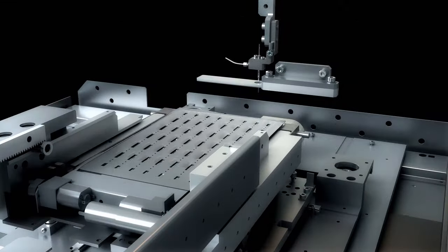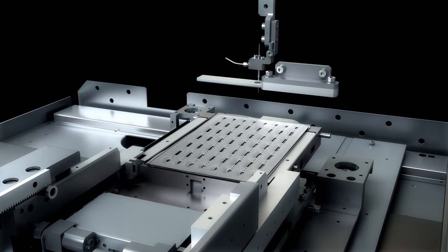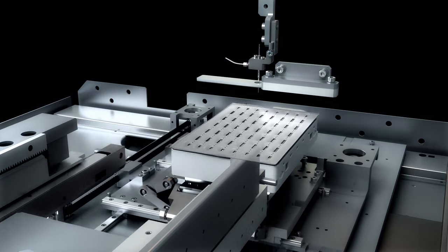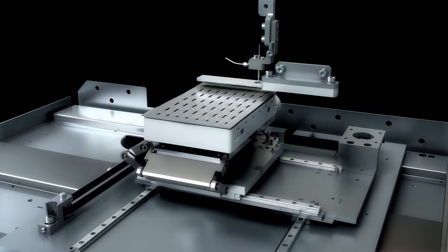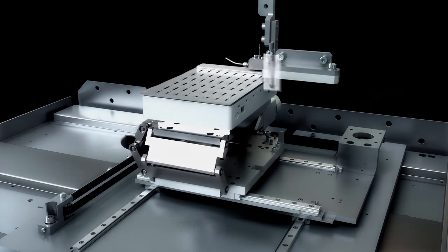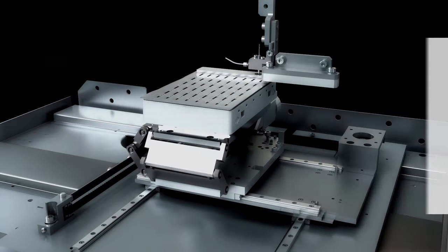The plate is then moved to the droplet reader module. Here, the foil seal is pierced by the droplet reader, and droplets are taken up and read by the QX1 with improved optics, fluidics and motion control.